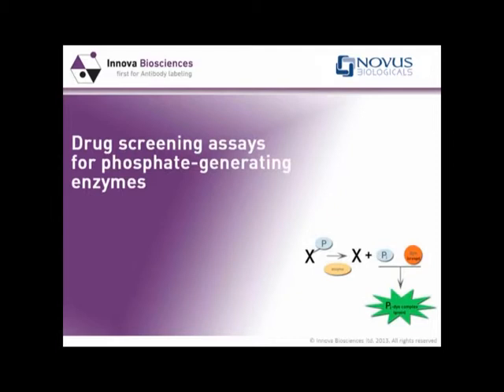Today's webinar, Drug Screening Assays for Phosphate-Generating Enzymes, will discuss methods of phosphate detection and focus on phosphate-generating enzymes such as ATPases and GTPases.